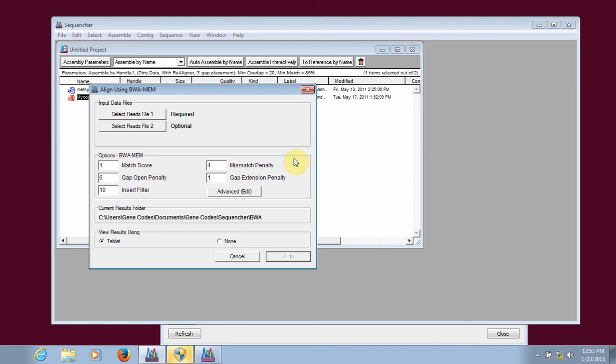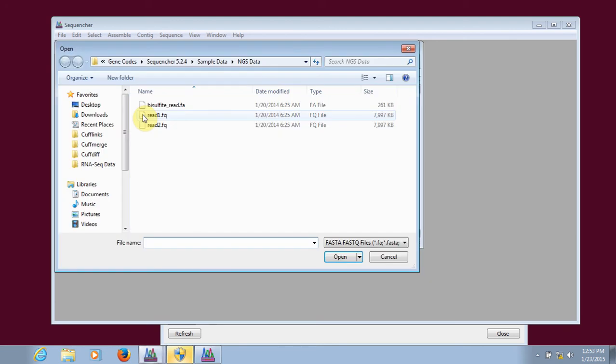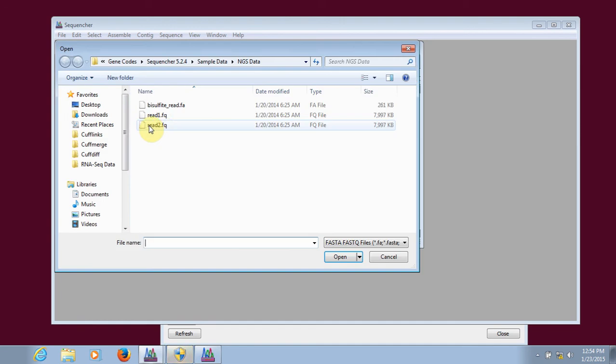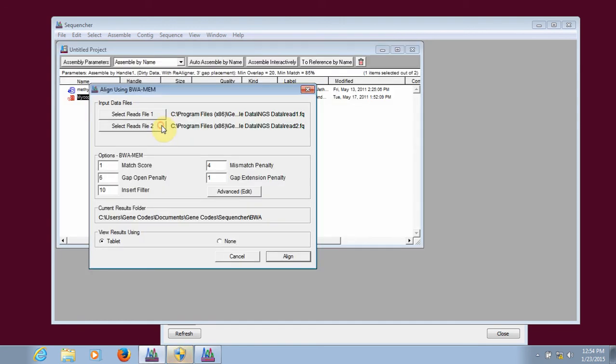To import the reads, I click on the Select Reads File 1 button, and then select the reads file. It's important to note that your reads files need to be in the FASTQ format. If you have paired-end reads, which I do, you also click on the Select Reads File 2 button, and then select the reads 2 file.